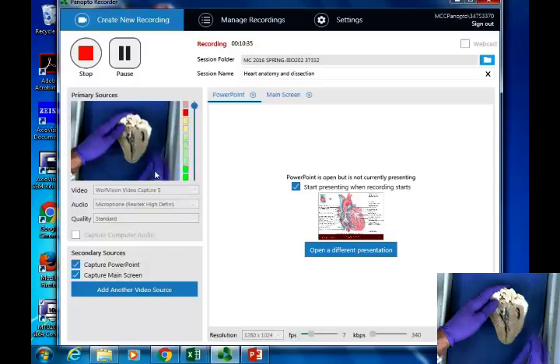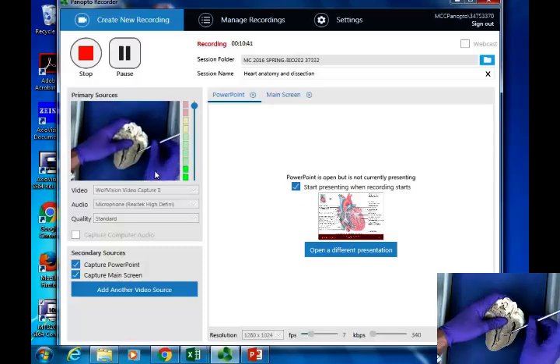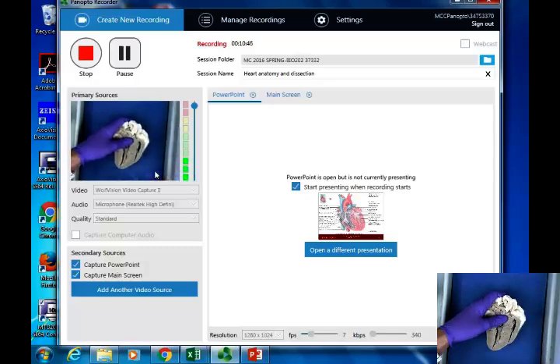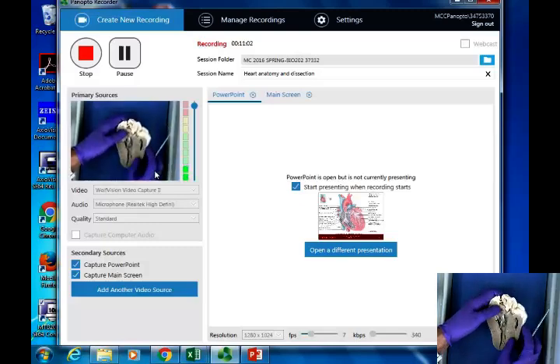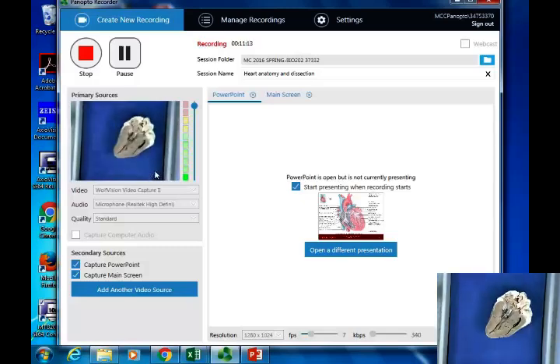For the right side, again, right ventricle, we can see very clearly. You can actually see what's called a moderator band right here, which helps to make sure that that right ventricle doesn't distend too much when it fills. But in order to see the right atrium, etc., and the right AV valve, you really have to follow it around and work your way up to it. It kind of curves around, so it's much harder to see. So oftentimes we can't see the right atrium, and we can't see the pulmonary trunk and the pulmonary valve. Okay, any other things we can see? In the middle here, we can see the interventricular septum. So this is the dividing line between the two halves of the ventricle.